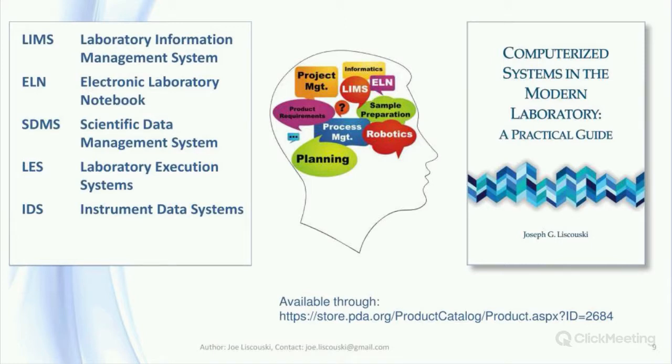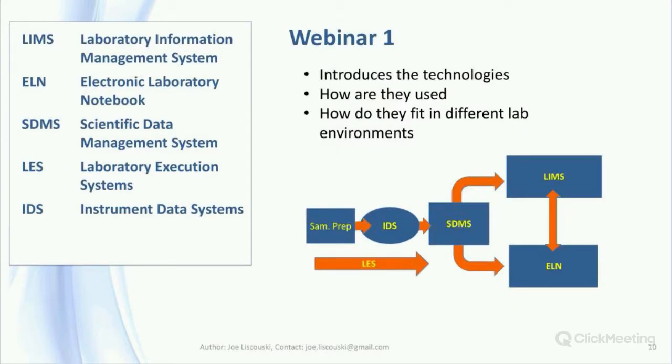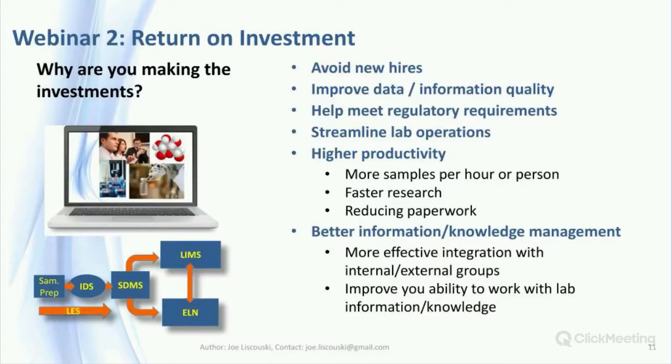It should prove to be a useful reference as webinars get into more technical detail. While the book focuses on the details of the technologies, the webinar series looks at how to plan and implement systems to meet your needs and the points noted in the survey. Webinar 1 begins by looking at laboratory informatics technologies that have been available for decades. But what do they mean to your lab's operations? This webinar will introduce you to these technologies and help you understand what they offer and whether or not they can be applied to your lab's work.